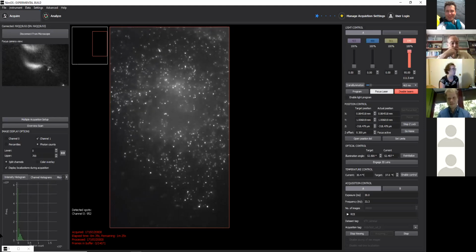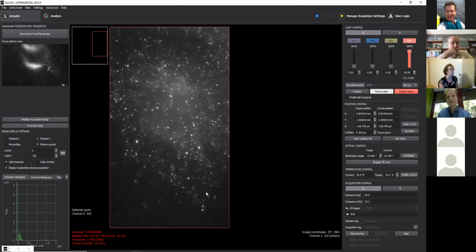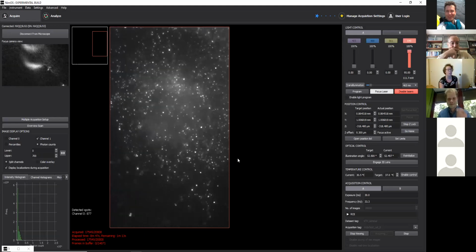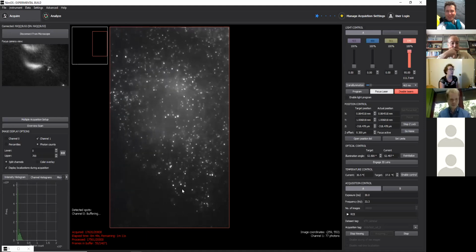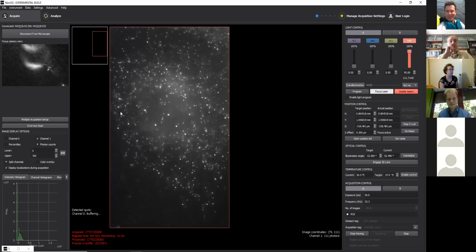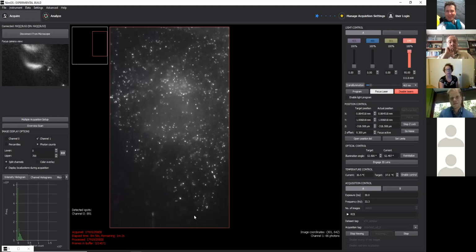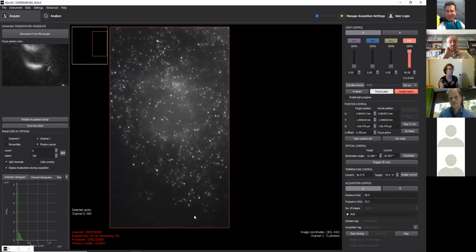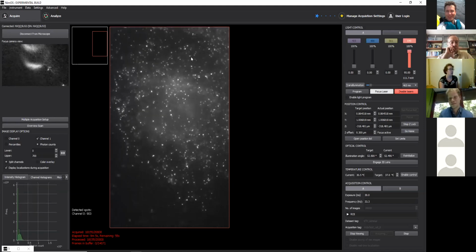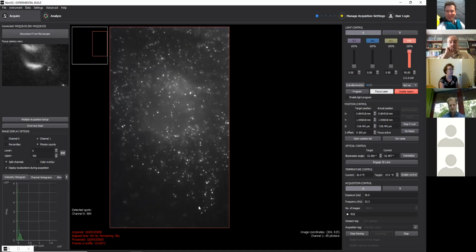Okay, and what we're looking at now are those blinking fluorophores, which are required to collect a DStorm image. So here, it might be hard to tell, but actually this is a mammalian cell that's been stained with an antibody against tubulin. So we're actually going to be looking at the microtubule cytoskeleton network.